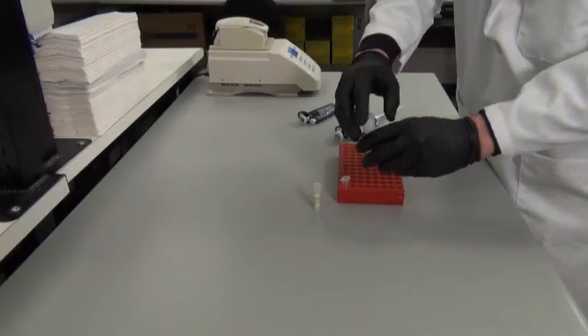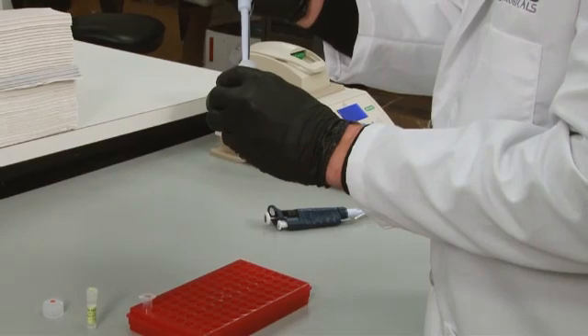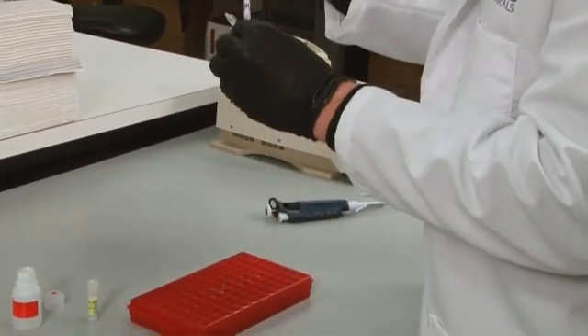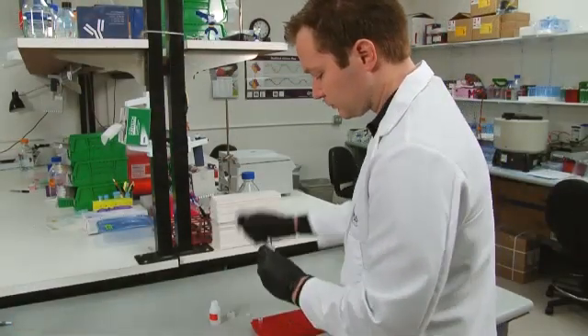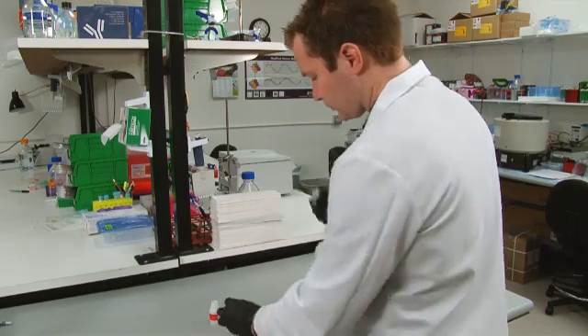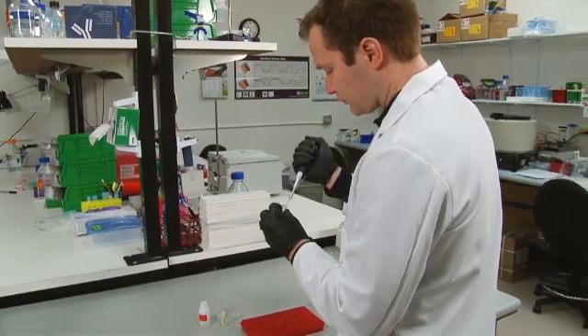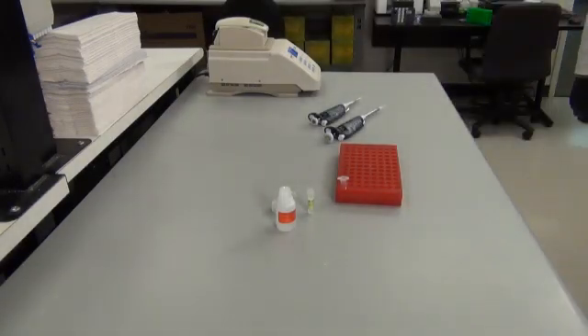To test for shearing efficiency while optimizing this phase, and optionally afterwards, run one aliquot of your sample on a 1.5% agarose gel. To do this, dilute the 40 microliter sample with 160 microliters of IP elution buffer and 8 microliters of 5 molar sodium chloride. All buffers are detailed in the written protocols found in the support section of the Novus website.